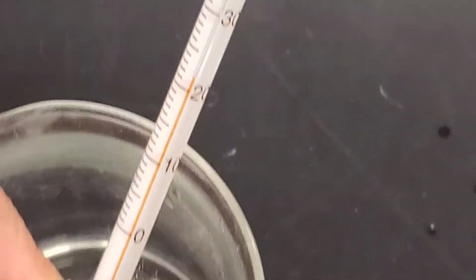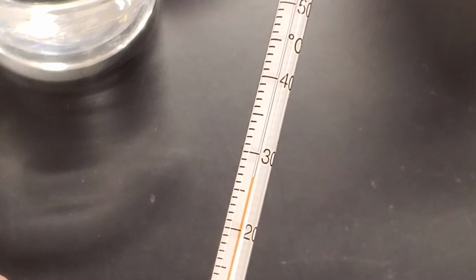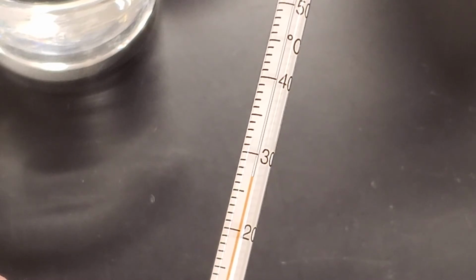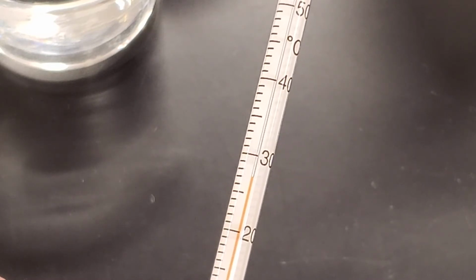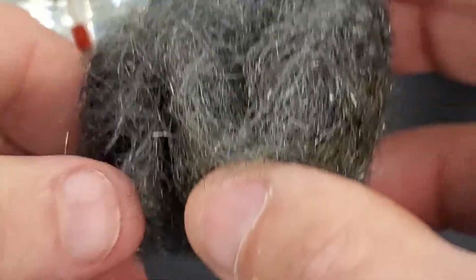We will scroll up so that we can see the temperature yet again and watch to see if we see any changes over the course of the next minute. All right, so go ahead and take that temperature there, and we'll use that one for our recording. Again, we want to make sure that we pay attention to any changes that might have occurred.